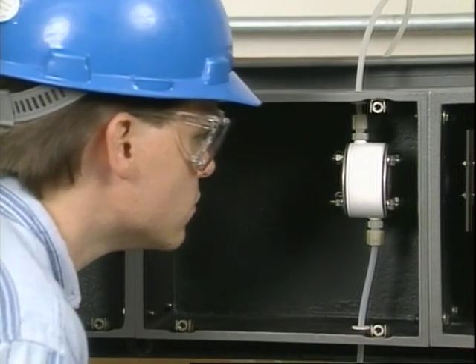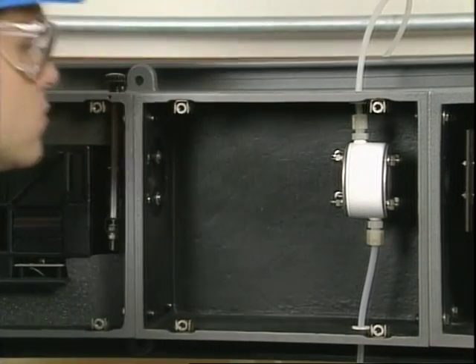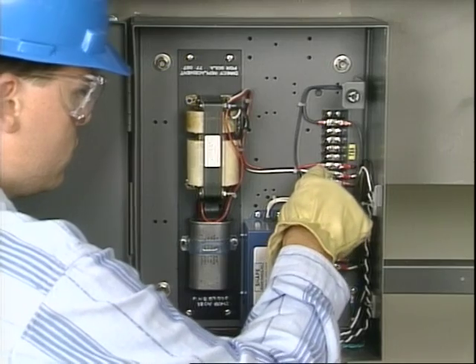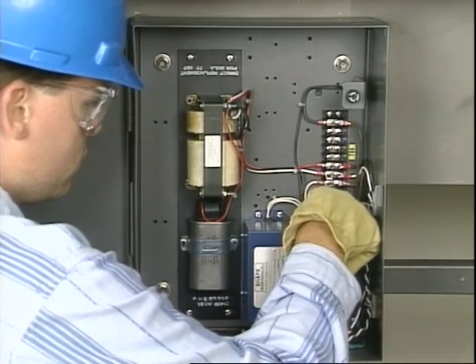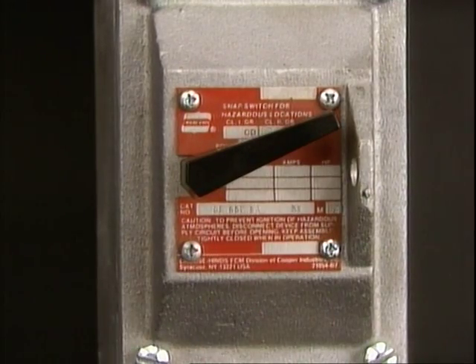Check the sample cell for evidence of leaks and check the cell windows for cleanliness. Repair any leaks and clean the cell windows as necessary. If your analyzer is heated, check for evidence of overheating. If your analyzer is steam heated, check for leaks and make repairs as necessary. Check the wiring and connections on the power supply unit and control station. Repair or replace any damaged or corroded parts. Turn on power to the analyzer.